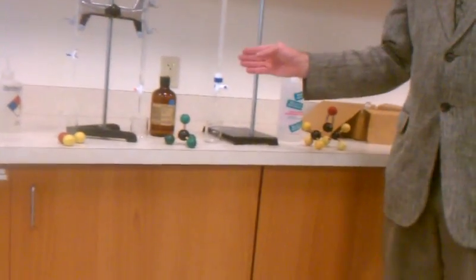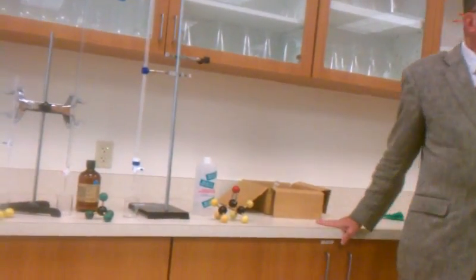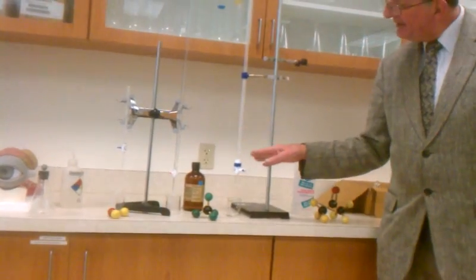So what must be true if we compare the density of water to the density of acetone? Because even though the acetone is less polar than water, the stream of acetone is bent further by the plastic rod than the stream of water. Which one would be more dense?